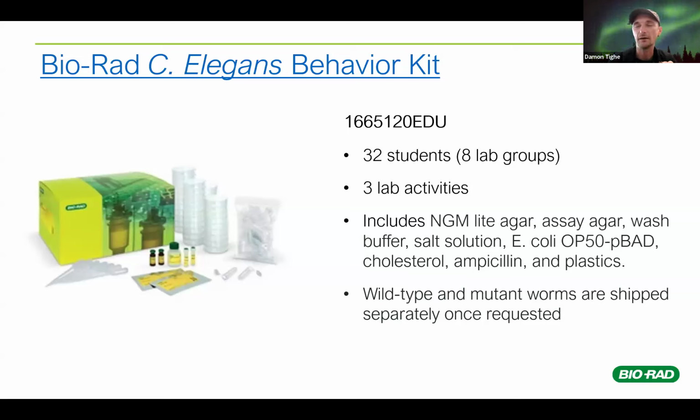I've seen a couple schools try things like caffeine with them, other types of chemical stimuli, to see if they can get a positive or negative chemotaxis from it. So the beauty of having them do this lab is it could set you up to have them design their own experiments based upon the scaffolding from this lab, because they can run a very similar model: add this thing so the worm associates food with it, and then assay that later to see, does that association hold true? Is it a positive association or a negative association?